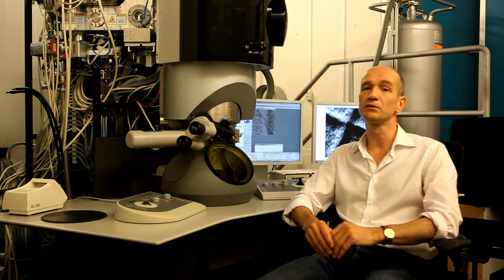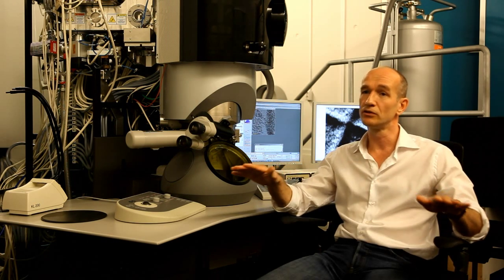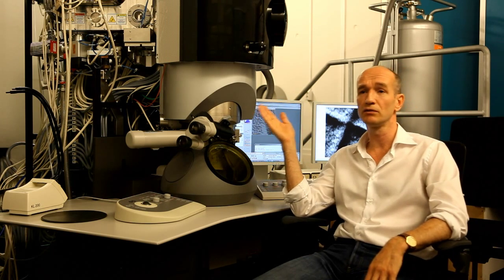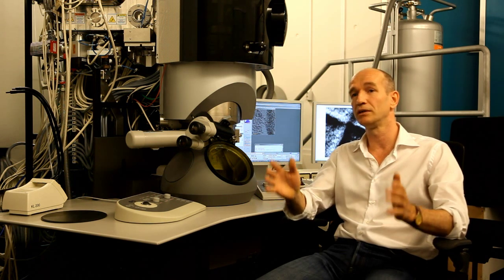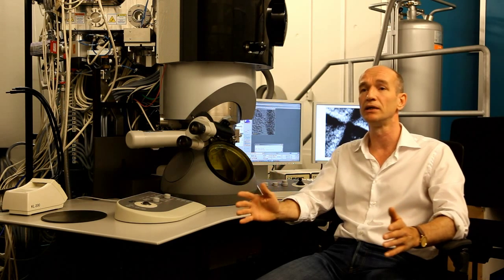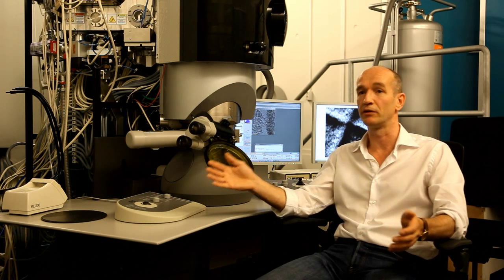One of the things we do is 3D electron microscopy. And this does not just generate flat 2D images, but 3D volumes. Because of the resolution of this microscope, these volumes contain an enormous amount of data. These data are enclosed in a very big file, generally bigger than 1 gigabyte. These files have to be processed, which generates even more of these big files.